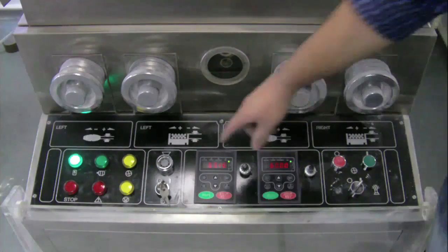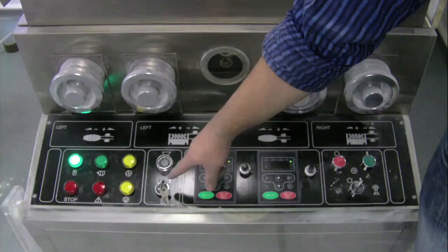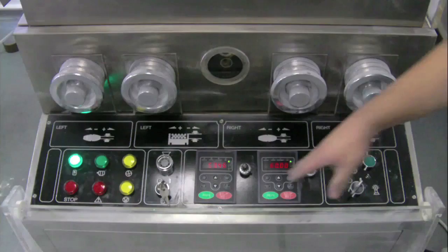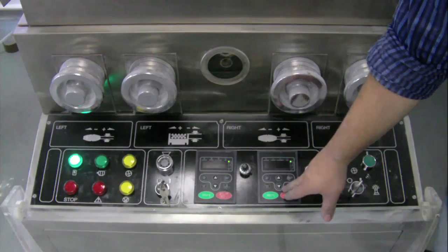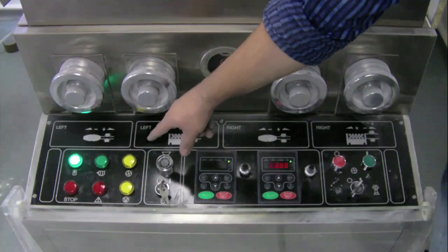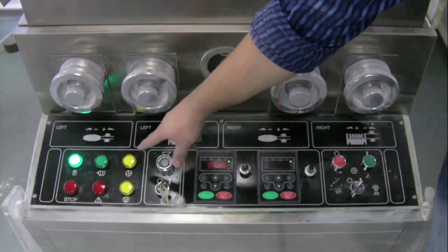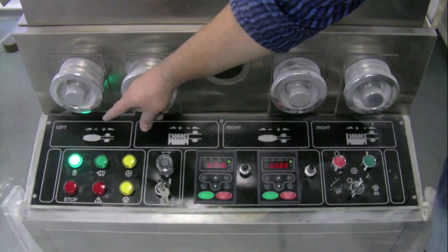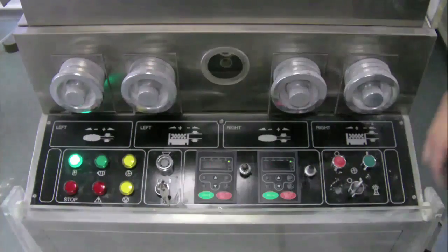The RTP41 comes with a master control key which allows you to disable the machine when you are not around. The machine has two panels which control the speed of the machine and the speed of the force feeders. It also has warning lights for your dust extraction system, the emergency stop button, the power inlet and other functions.